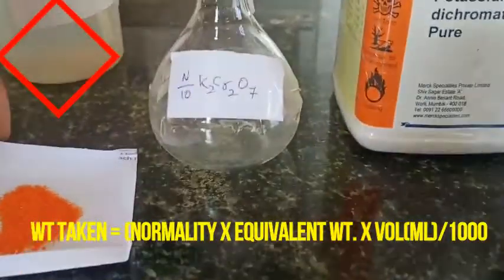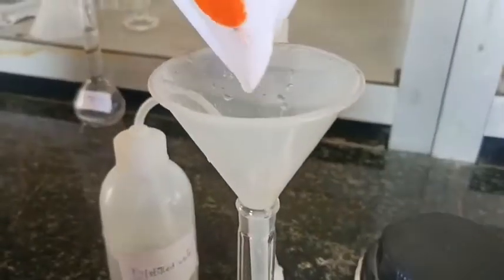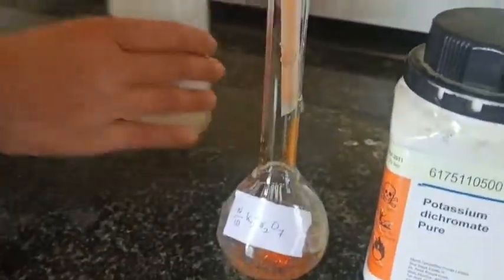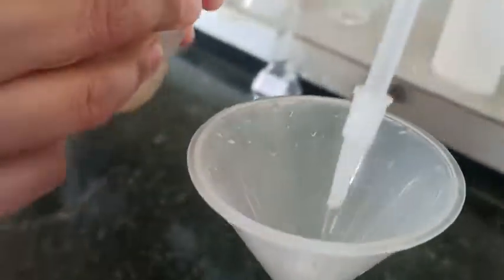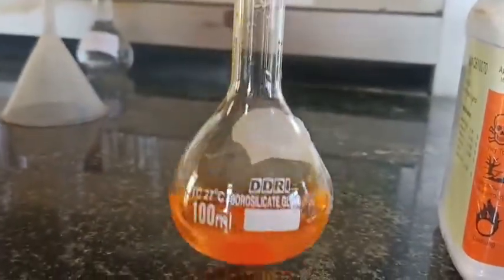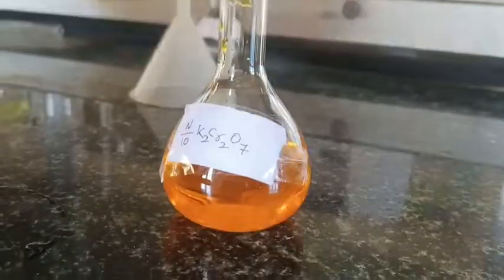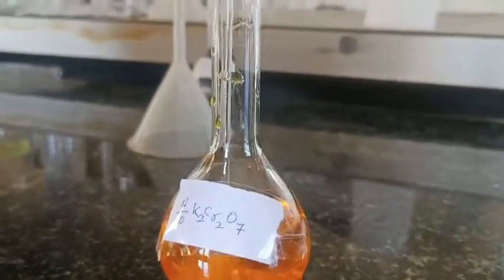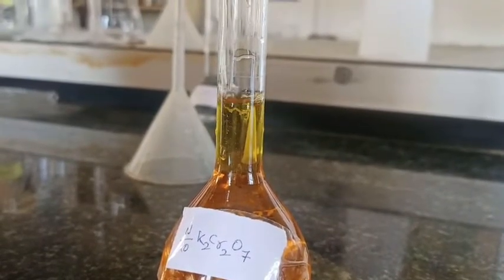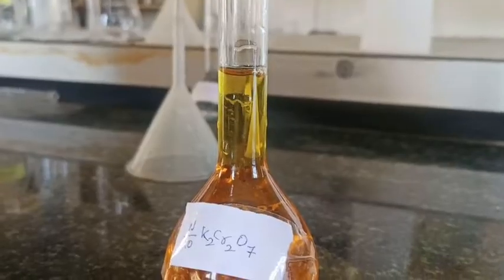Now we are going to prepare potassium dichromate solution. I have taken 0.49 grams of potassium dichromate, transferred it in the same way, and rinsed the funnel thoroughly. Dissolve the potassium dichromate completely first, then make up the solution up to the 100 mL mark and shake it well before use.